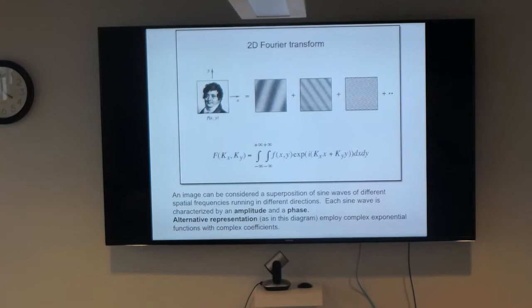You already had an explanation of Fourier transforms, so I can go through this very, very quickly. You can think of the Fourier transform as a decomposition into sine waves, where each wave has a different wavelength and direction of wave, and a different phase, and a different amplitude. So we mix all these different waves and all possible combinations of waves in order to recreate an image, any given image.